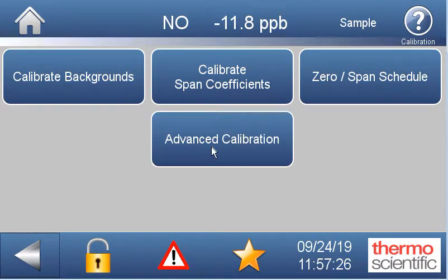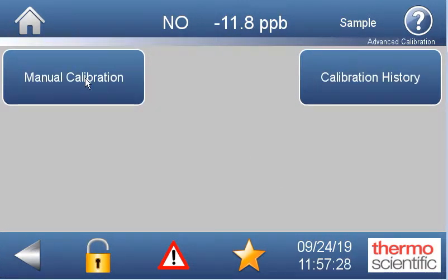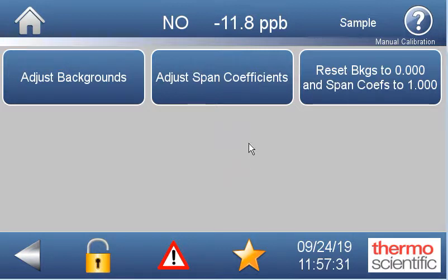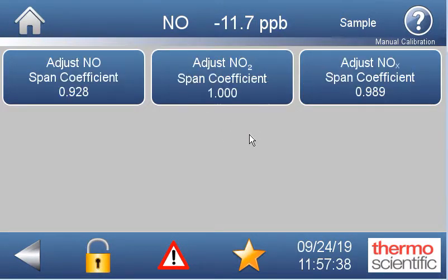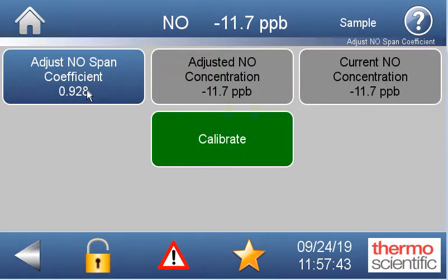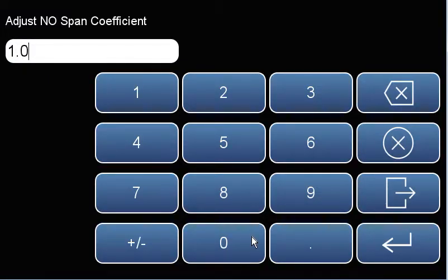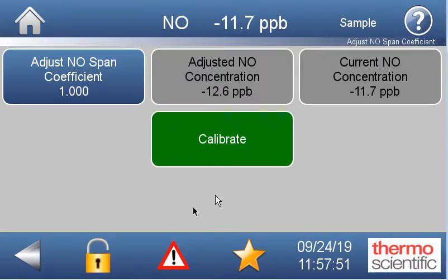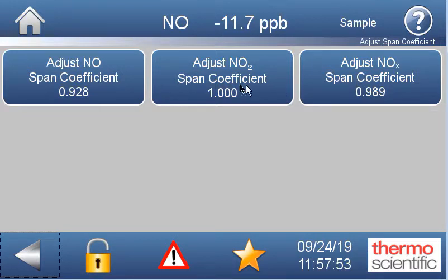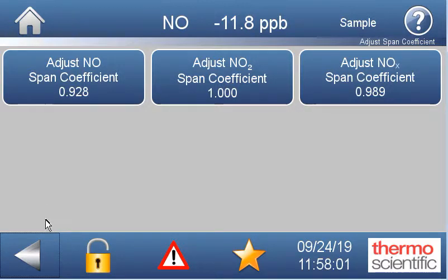We'll go then into advanced calibration and manual calibration. Once we're flowing our span gas and we know it's been flowing long enough that the instrument is stable, we'd go into these span coefficients and actually set all three of these to 1.00. You'd come in here, type in 1.000, hit enter, hit calibrate — you do that for each of these. All three need to be set to 1. At this point the background of the instrument has been set, but the span is going to be off.